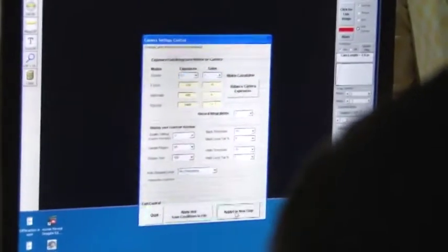Yeah, this is the beam stop. You don't see anything. The camera is poor. It has very low dynamic range. Do you think it's too low a number of particles? Yeah, that's one thing.